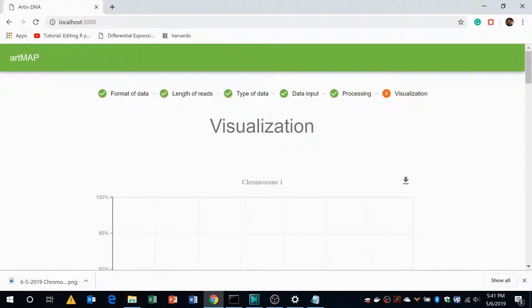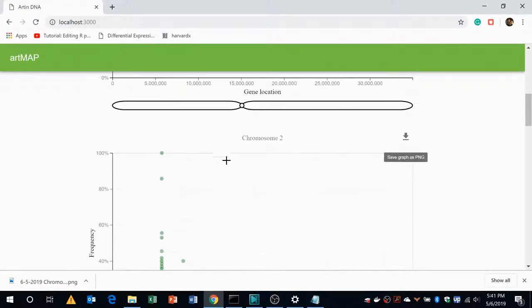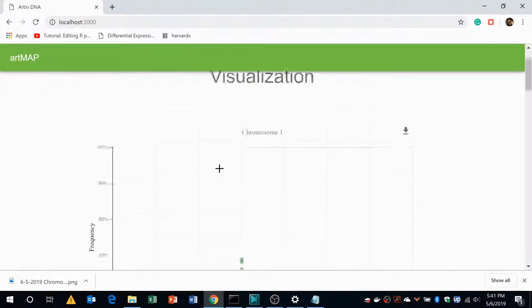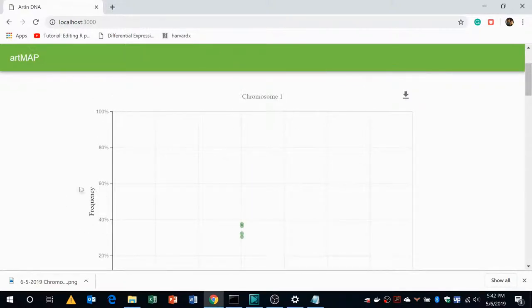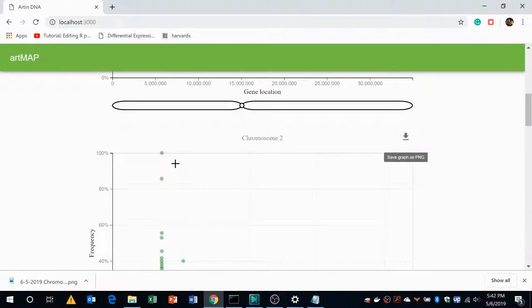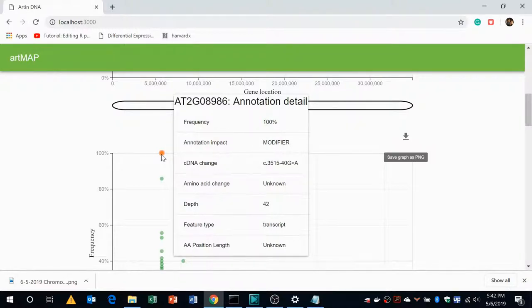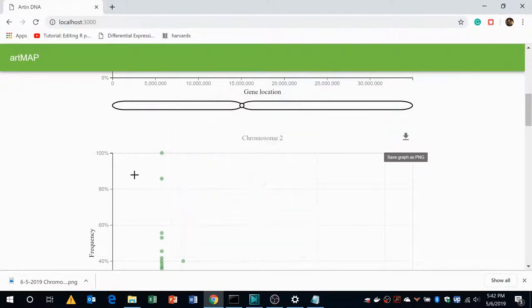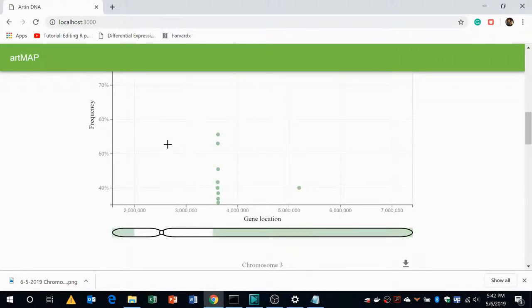After completion of the run, the result of the analysis is presented in the form of scatter plots. Since Arabidopsis has five chromosomes there will be five plots, one for each chromosome. In the scatter plot, the X axis represents the location of the EMS induced mutation whereas Y axis represents the frequency of the EMS induced mutations. The annotation detail of each mutation can be accessed by moving the cursor to the mutation which are represented as green dots and the details will be highlighted on the screen. You can also zoom in to these mutations by selecting them and also you can zoom out.